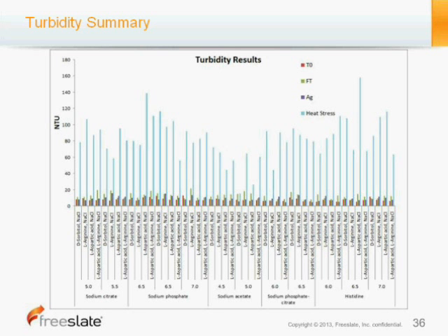Now I'll use this time to mention that there was a preservative, an antimicrobial agent, sorbic acid, which is FDA approved for such usages and should keep bacterial or any kind of microbial growth down, which could induce turbidity. In addition, when I was looking at the chromatography profiles, in the heat stressing we're seeing the same total area counts between T0 and heat stressing. So this would also suggest that we're not seeing bacterial or microbial influence on this system, but this is actually really occurring in these vials.